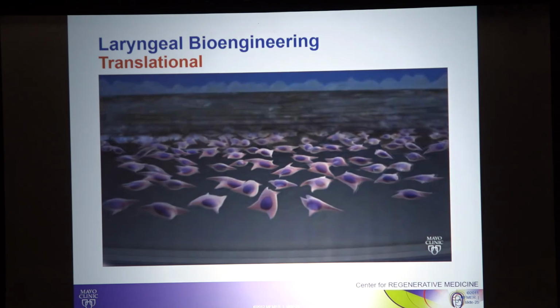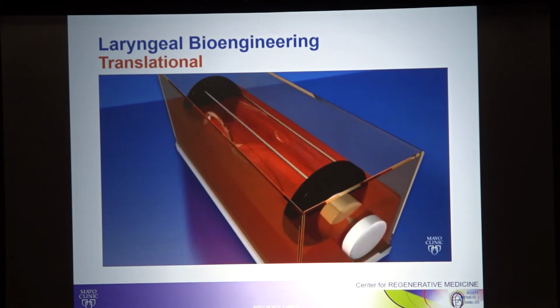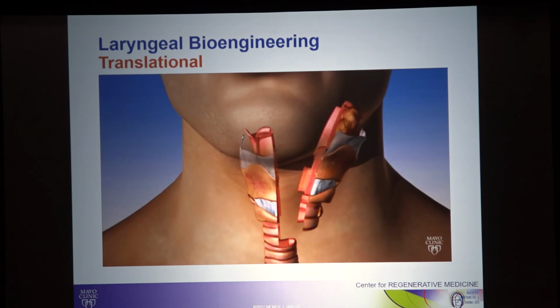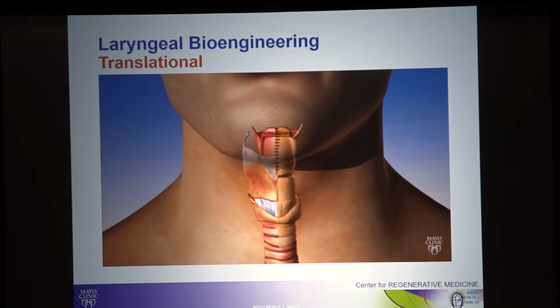You can separate the adipose-derived stem cells from the fat cells, expand them, differentiate them in this circulating bioreactor, what people use for tracheas. That process takes about 3 weeks. It's not fully epithelialized there, but it has a base layer on it. And then we can show through our animal models that the actual native stem cells within the body will come in and help to epithelialize that segment. So in about that 3-week time span that we shot for, we can show that we can at least get a seeded scaffold that we can implant at the time of surgery.